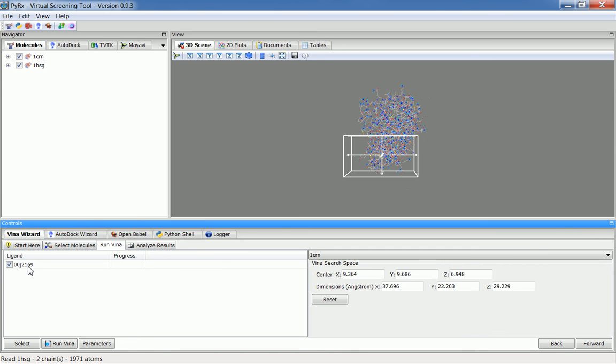Here you can see that we have two receptors and one ligand. If I click Forward, this will run these ligands against this receptor and show the docking result.